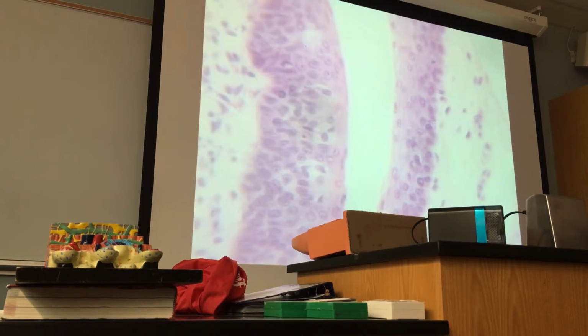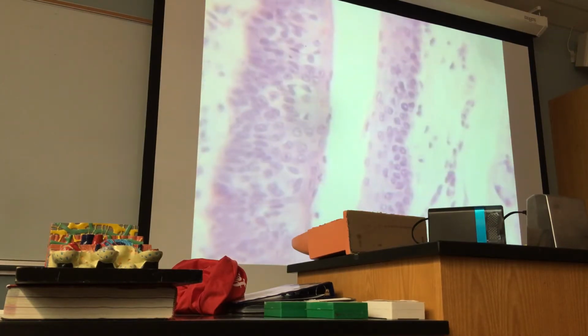These are special cells, sensory cells. And here is the taste bud pore. Many taste buds. This one, this one, this one. These. If you go to a histology book also, you can find the taste buds. If you want to see the taste buds, you have to go to chapter 17 that deals with special senses, okay?